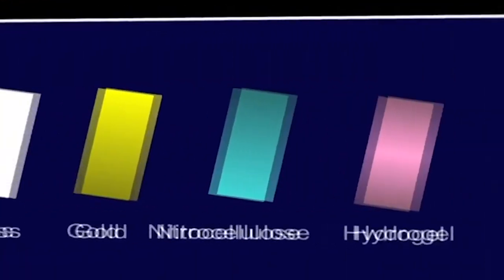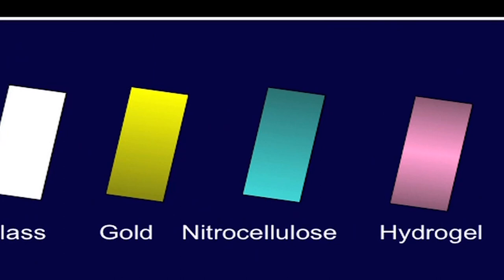After completing the DNA prep, you need to now functionalize the glass slide surface for printing purpose. One can use different types of surface, for example, glass, gold, nitrocellulose, hydrogel, etc. There are different properties that one needs to look for when selecting the surface. Cost is a major factor when you are talking about experiments such as biomarker discovery.